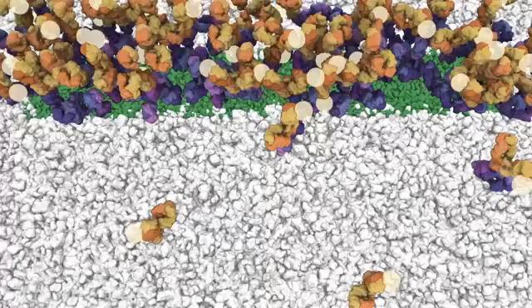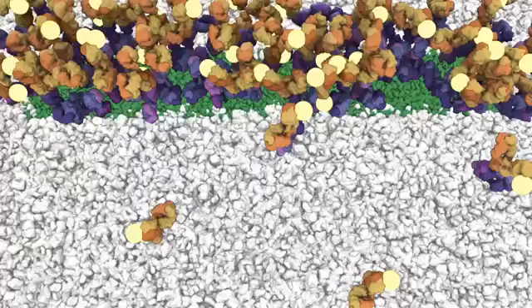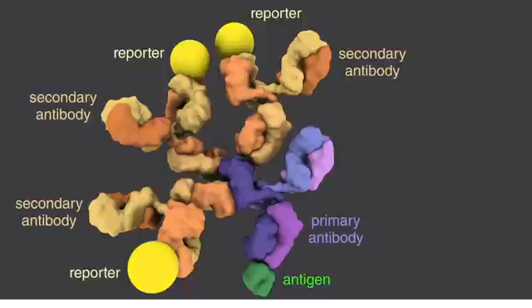Secondary antibodies are bound to a reporter enzyme or a fluorophore, which allows for the visual detection of primary antibody binding to the protein or modification of interest. Secondary antibodies also amplify visual detection because multiple secondary antibodies can bind to a single primary antibody.